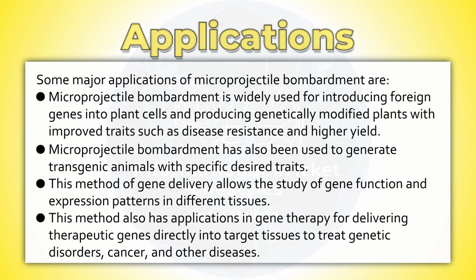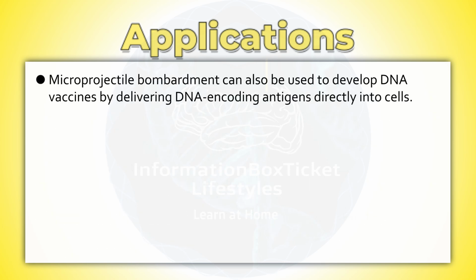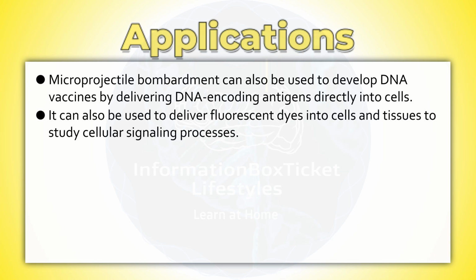This method also has applications in gene therapy for delivering therapeutic genes directly into target tissues to treat genetic disorders, cancer, and other diseases. Microprojectile bombardment can also be used to develop DNA vaccines by delivering DNA-encoding antigens directly into cells. It can also be used to deliver fluorescent dyes into cells and tissues to study cellular signaling processes.